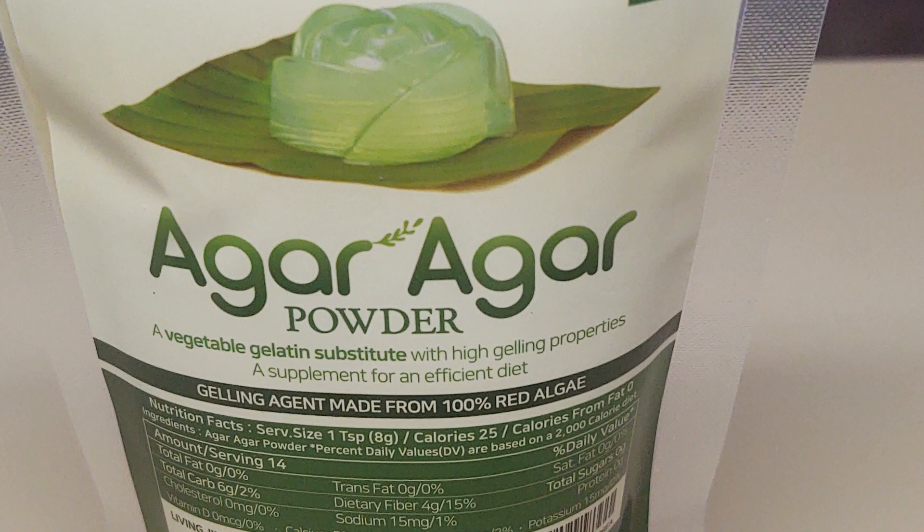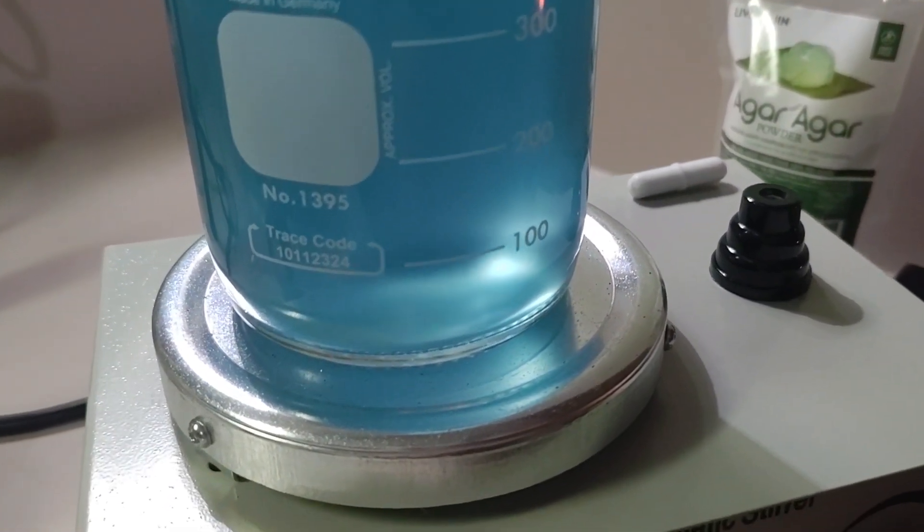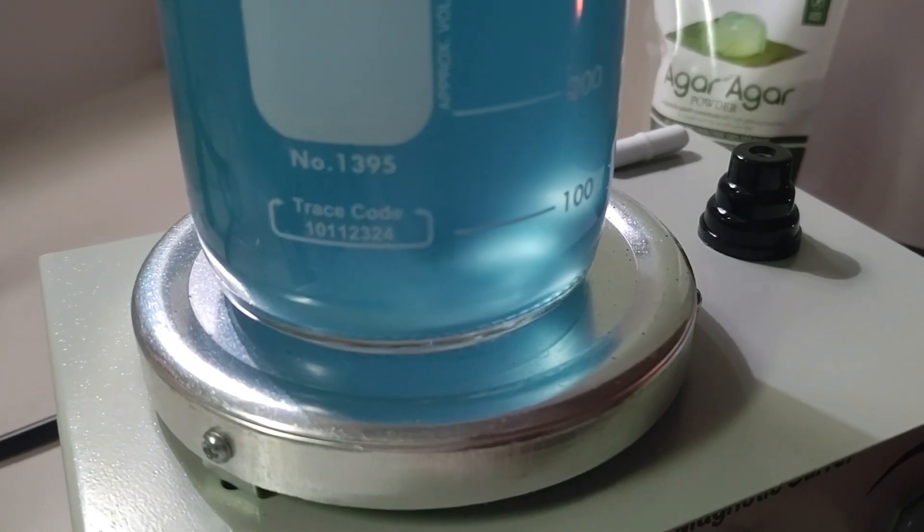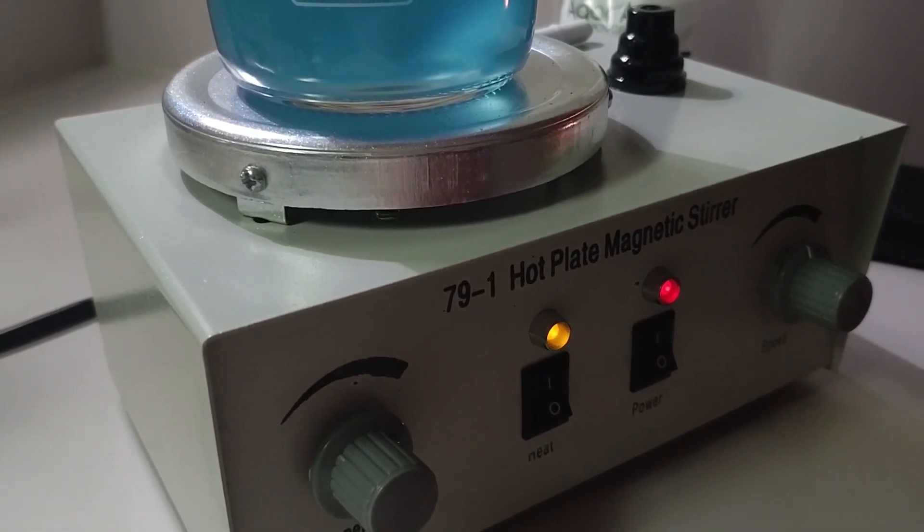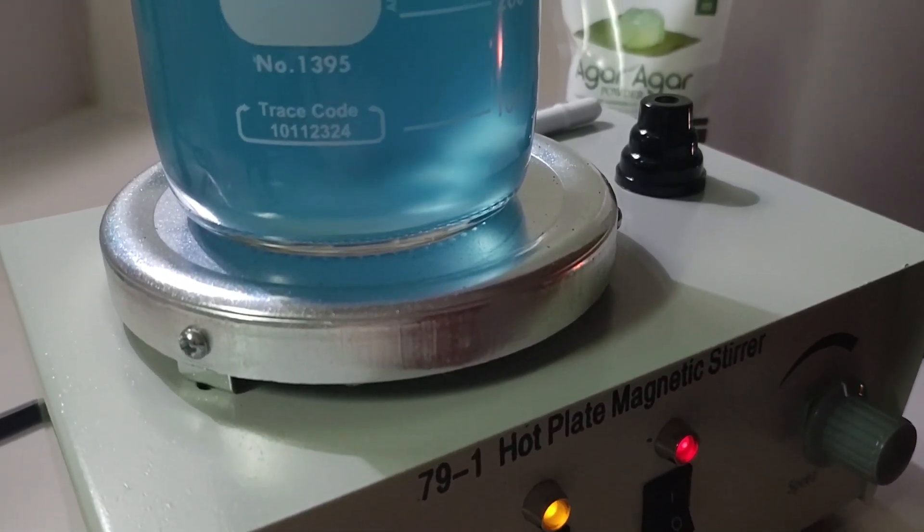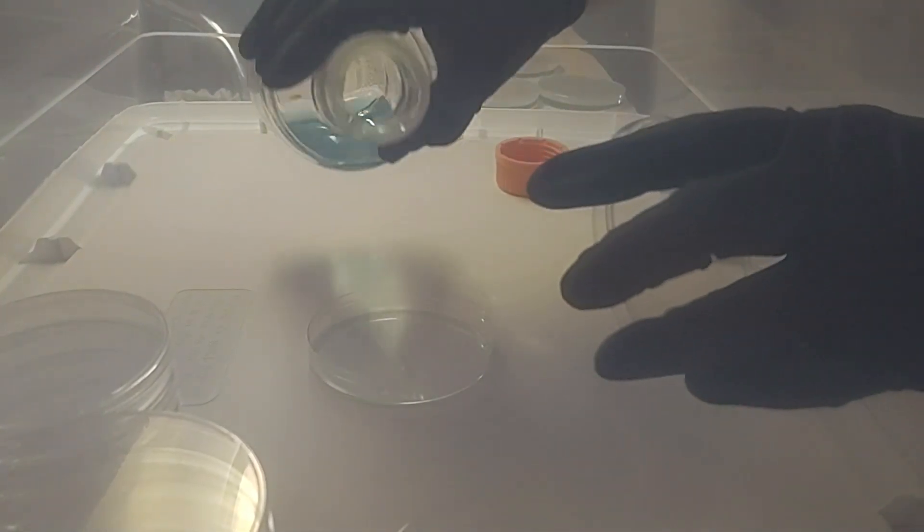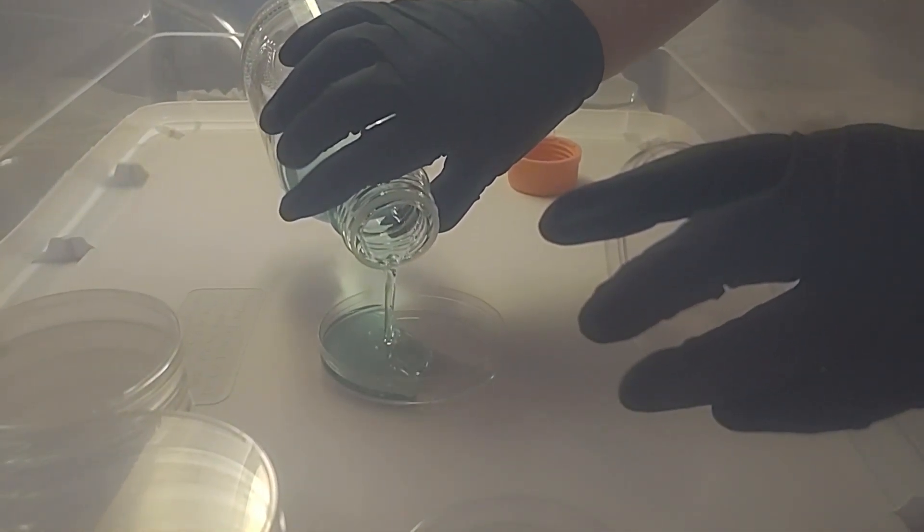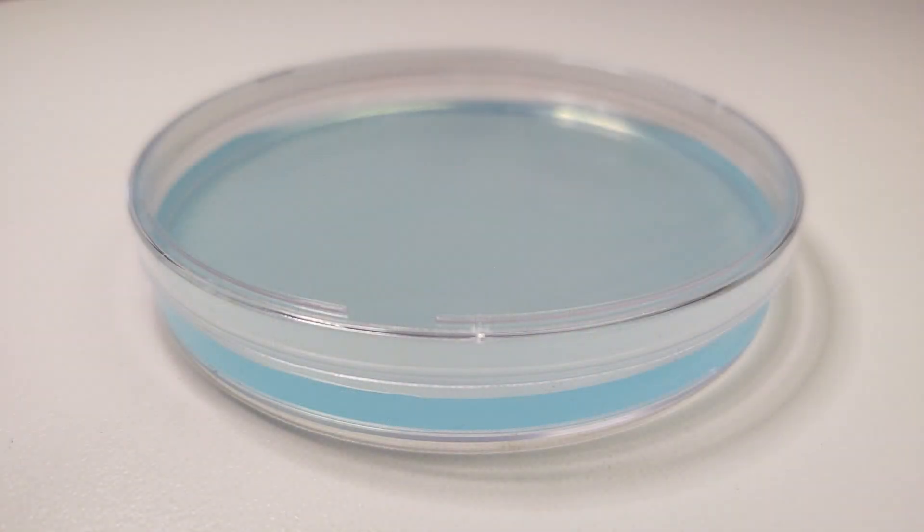Our recipe uses 10 grams of agar for 500 milliliters of boiling purified water or you can use 5 grams of agar for 250 milliliters of water. Using 90 millimeter petri dishes we pour 24 plates with 500 milliliters and we pour 12 plates with 250 milliliters. The size of your plate and how full you fill your plates will determine how many dishes you will create.